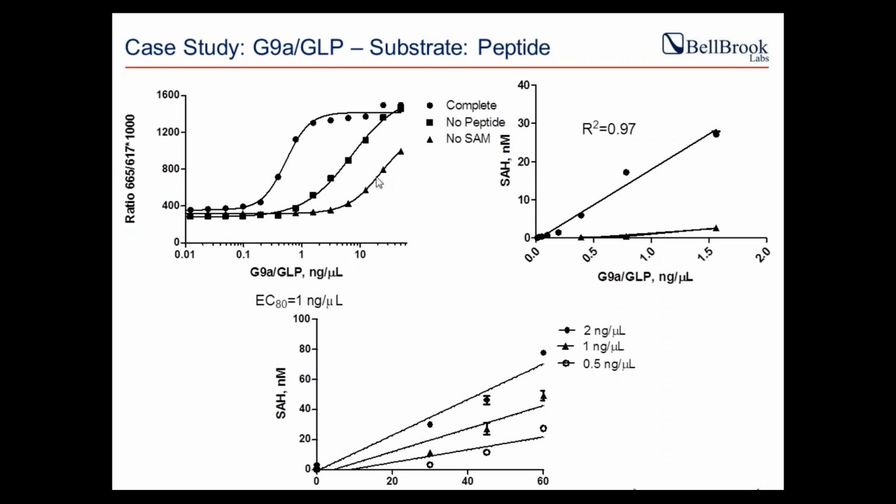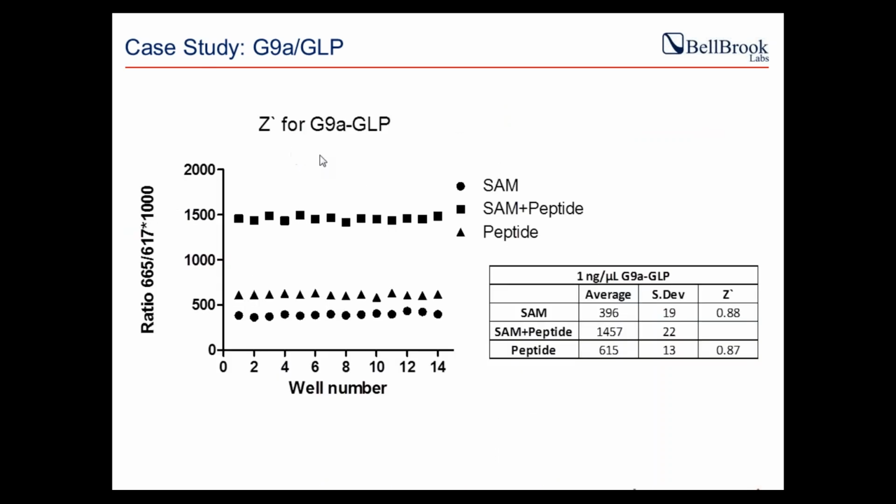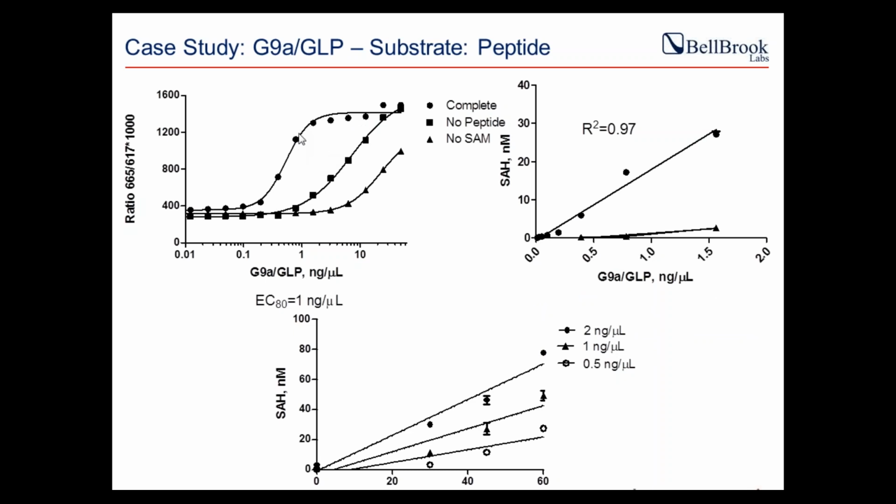So we do see that this is very characteristic of many methyltransferases and kinases. People who have worked with methyltransferases would have seen graphs like this, that at high concentrations of the protein, you would see some kind of non-specific reaction. Either water goes into the pocket, or it's a common phenomenon seen with both kinases and methyltransferases. However, the concentration that you would pick for your dose response curves or to do hit analysis would be somewhere in this region.